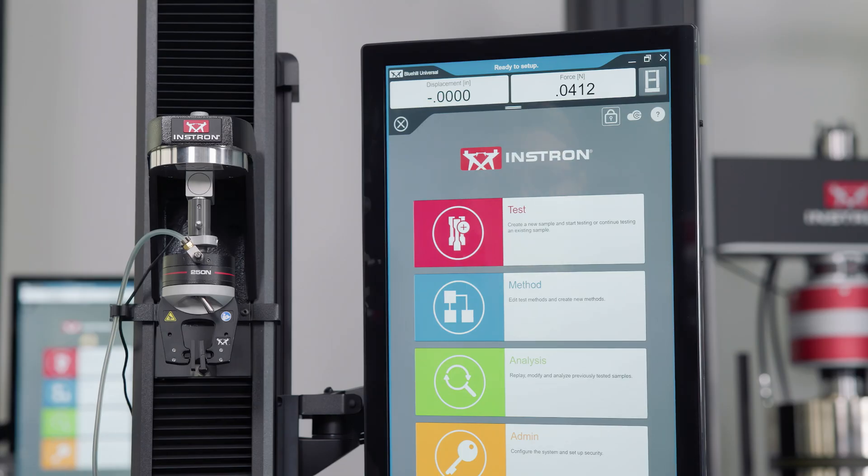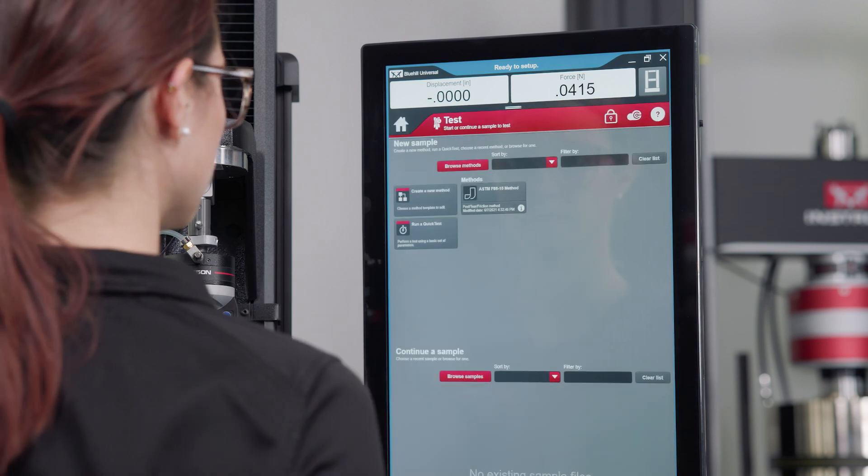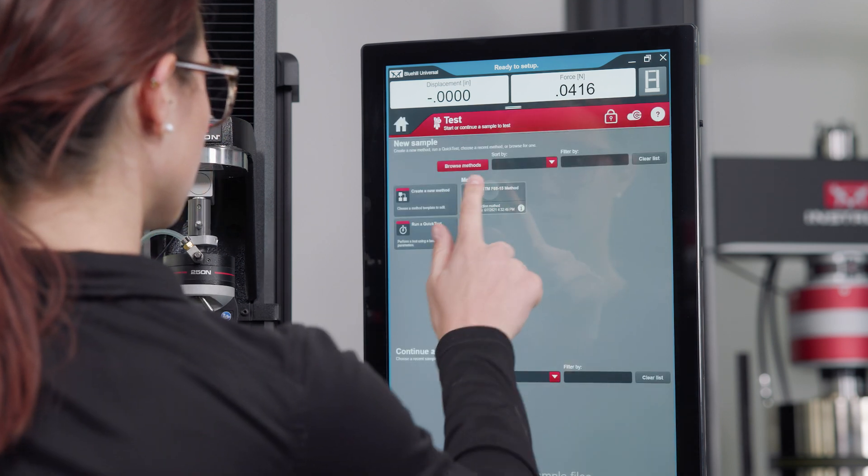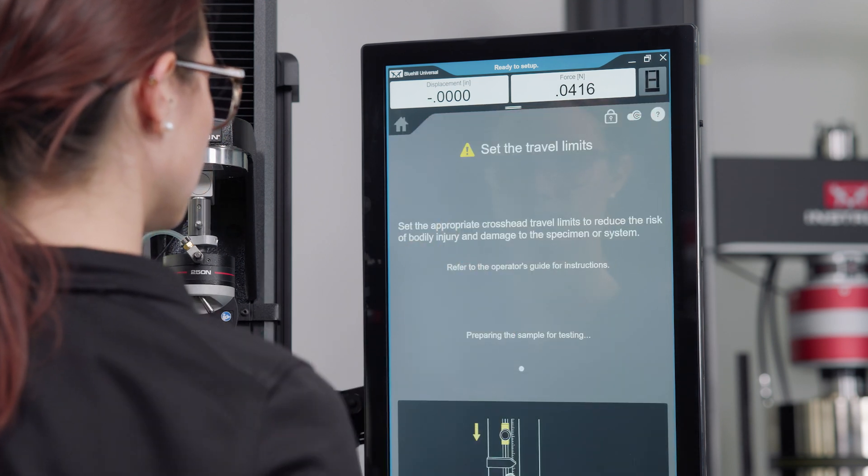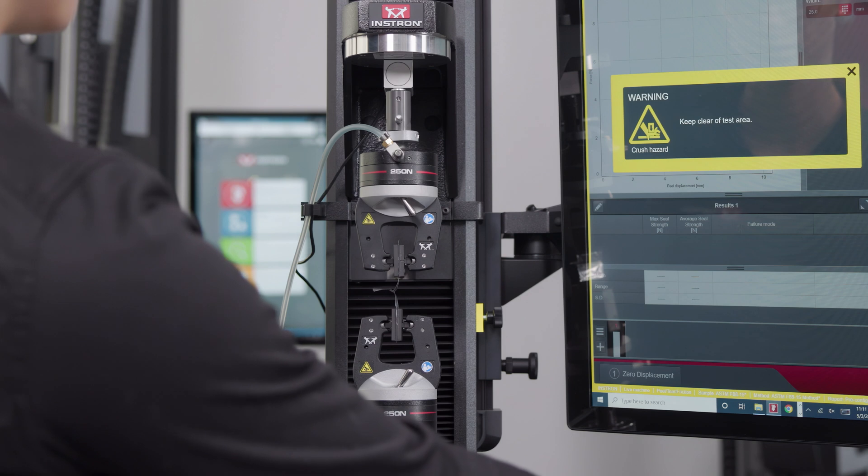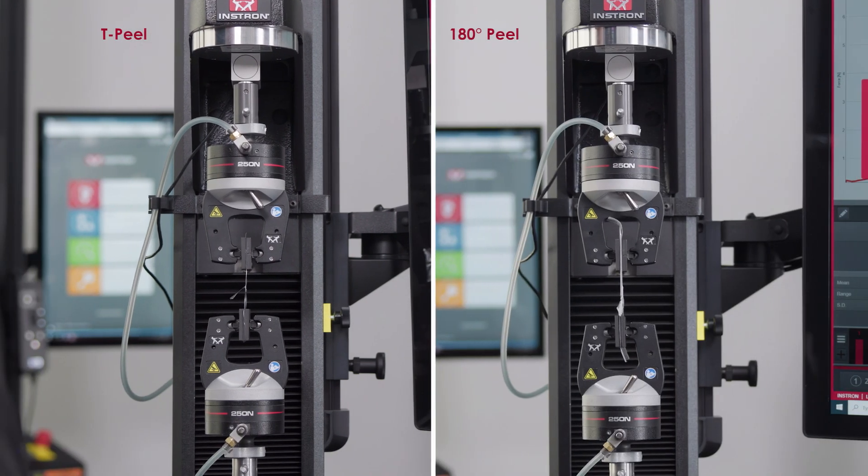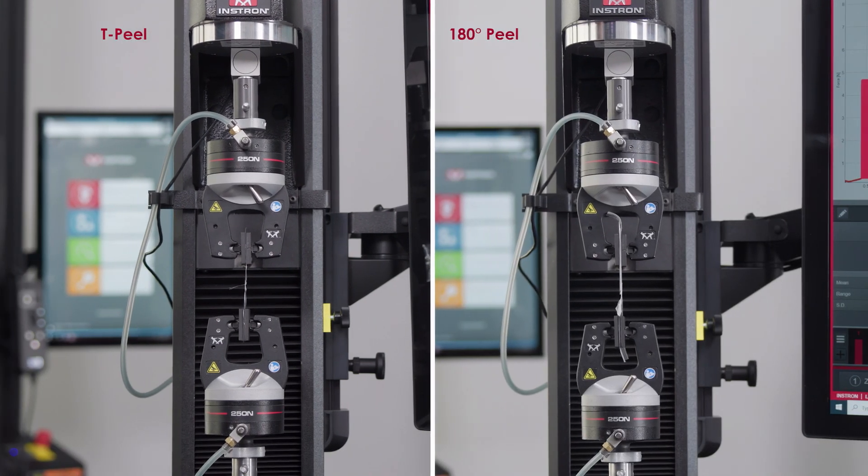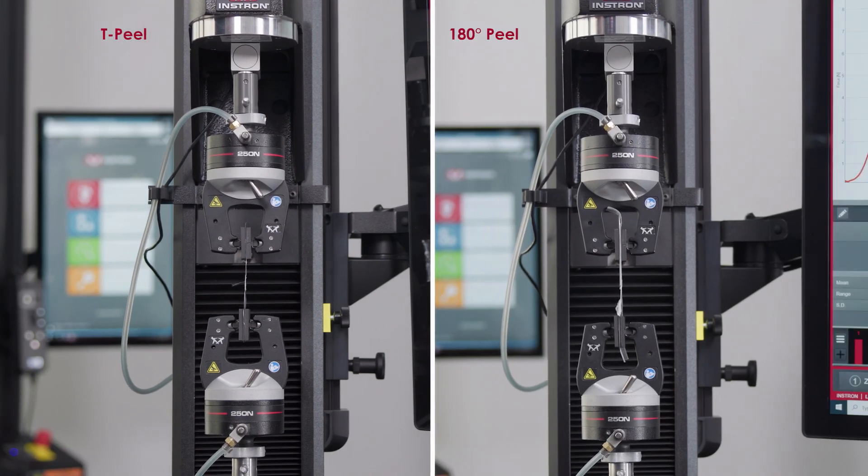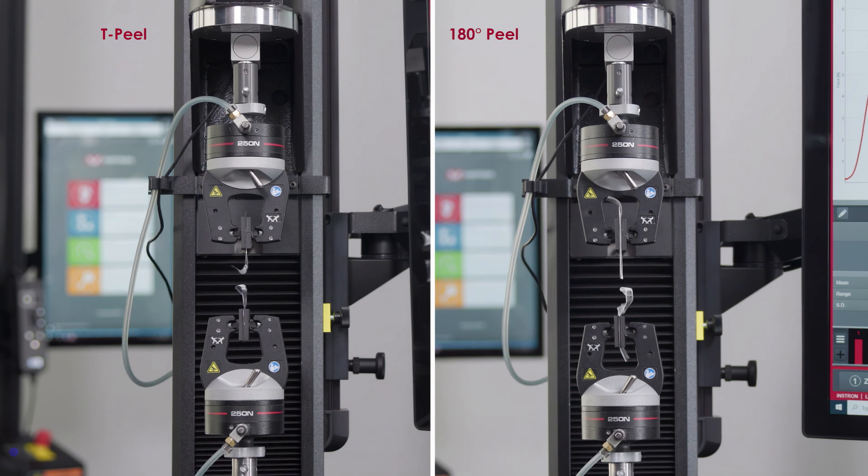The ASTM F88 test method is included in Bluehill Universal's Biomedical Method Suite. Bluehill Universal software correctly relates crosshead movement to the peel distance based on the specific peel type chosen.